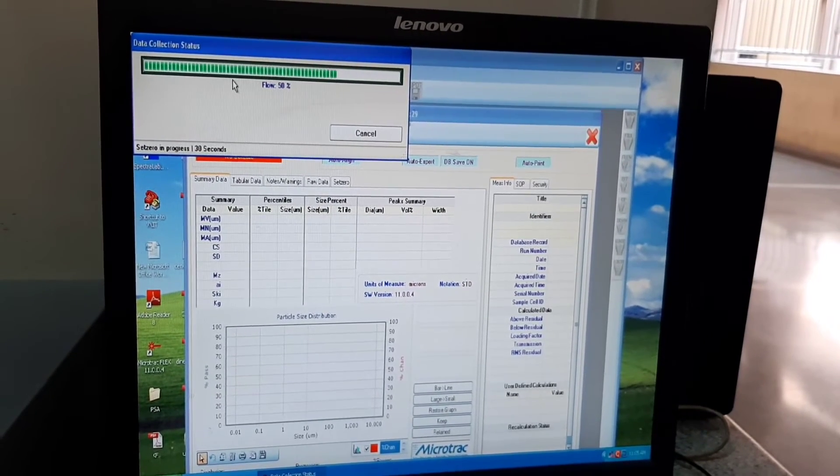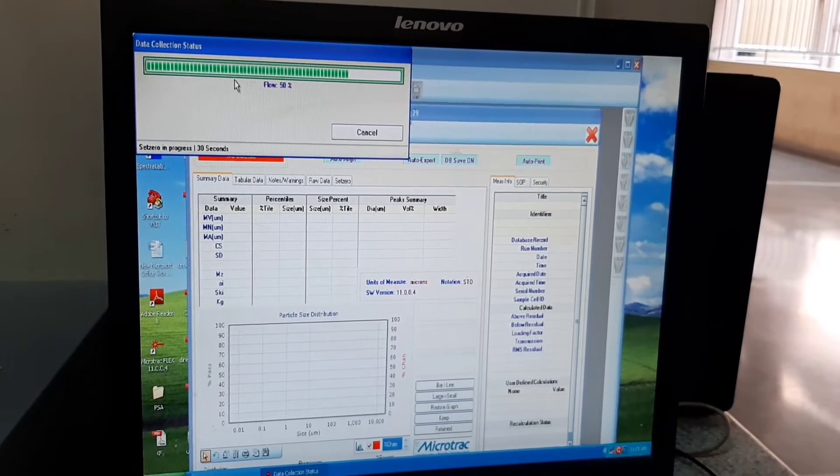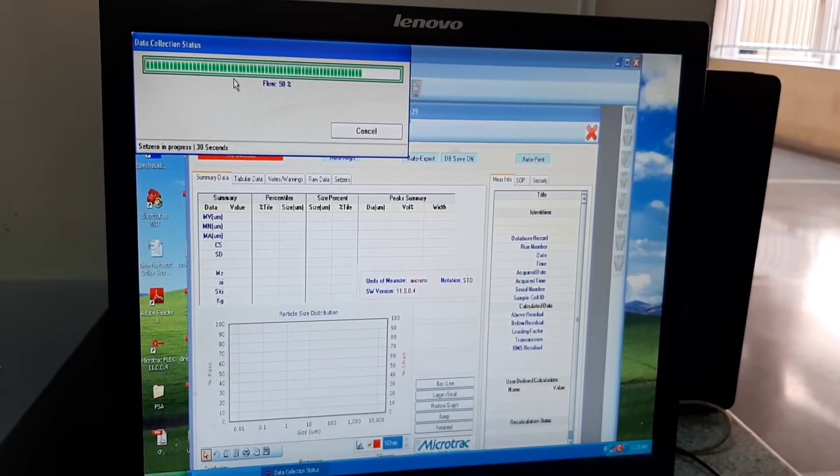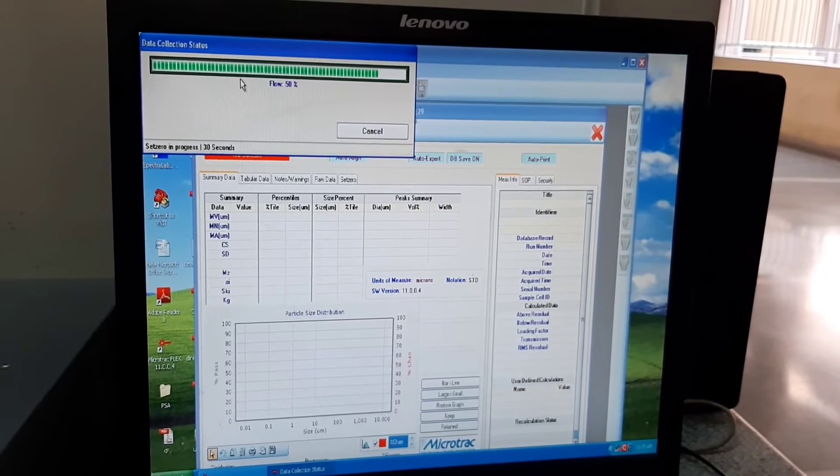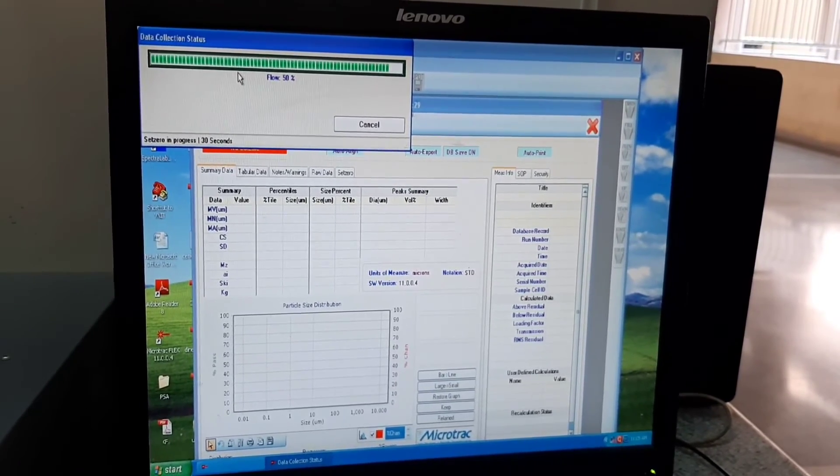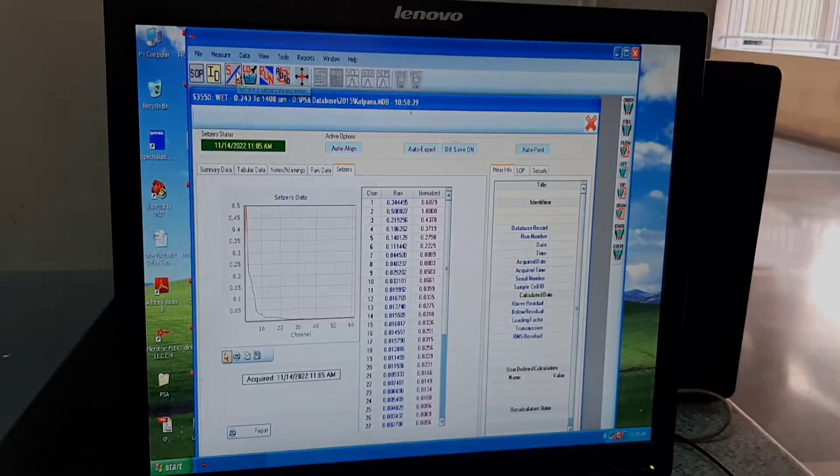This is to ensure that the concentration of sample is optimum, and once the dilution is done, the machine starts to analyze the sample.